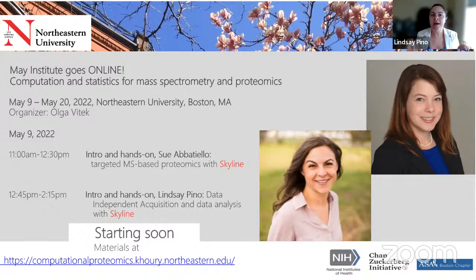So in this section, I'm going to go a little bit more into data independent acquisition in the lecture portion. This is to help set you up for tomorrow and Wednesday when Brendan McLean is going to be walking you through doing more in-depth Skyline for data independent acquisition. And then in the hands-on section, I dropped the tutorial download in the chat.